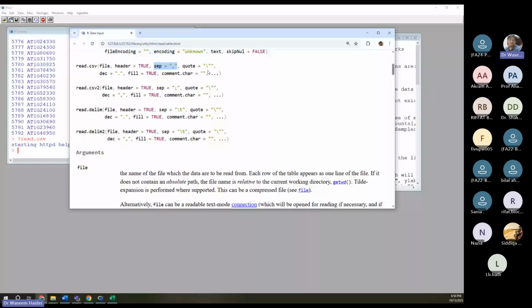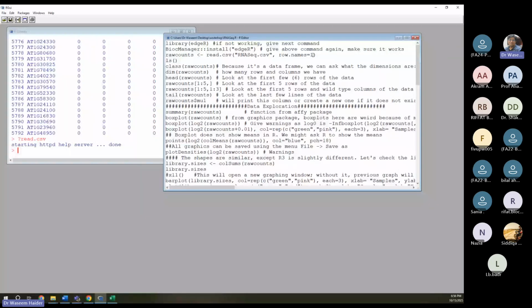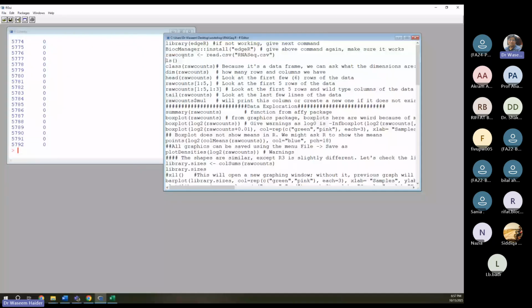Here, one thing we did was, let me go without it once to show you what we are doing. You can select the code on the right side and do Control R, so only that piece of code will be executed. If you don't select anything, the whole line will be executed. So now it's not printing, but it's storing it in an object named raw counts.